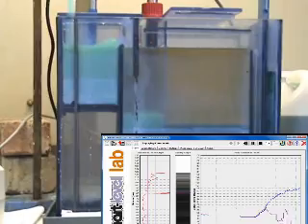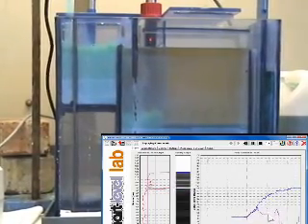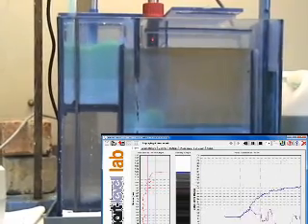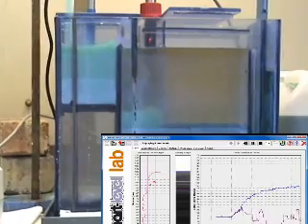Here we have one flow rate. And in a short while we change the flow rate, increase the flow rate. And you'll see the emulsion phase thickness increase.